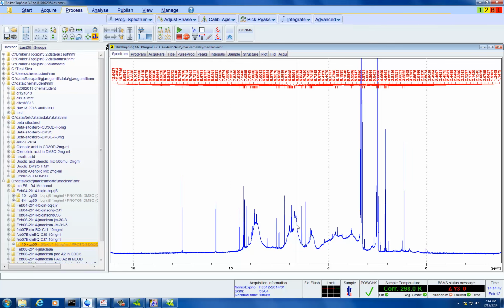So now when you use any other method for whatever samples you have, it will take that information and quantify any compound in there. You guys just need to figure out what quantification standard you are going to make. If I use epicatechin, I can just quantify the concentration of epicatechin in my sample.